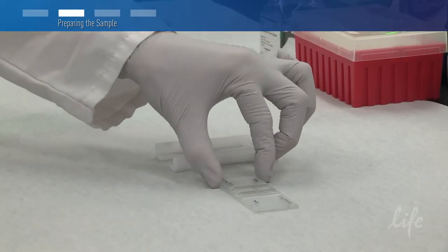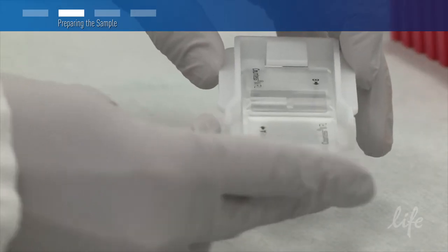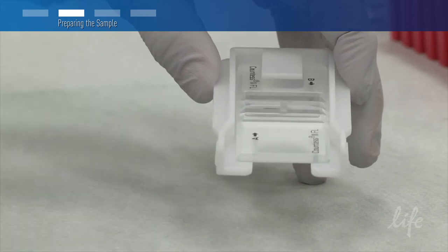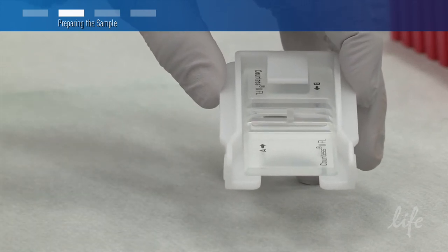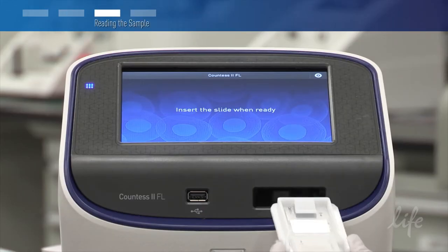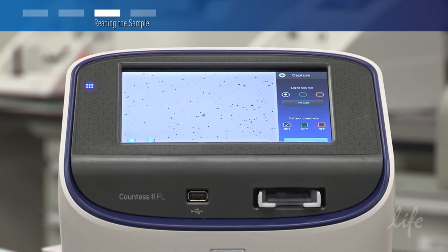Once you have your sample prepared, place the reusable hemocytometer into the slide holder. Make sure to insert the reusable hemocytometer all the way in so that it is completely covered by the slide holder flap. Next, insert the holder and slide together into the Countess 2FL sample slot until it clicks into place.